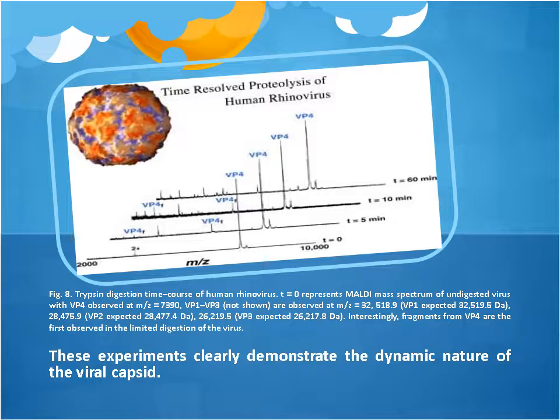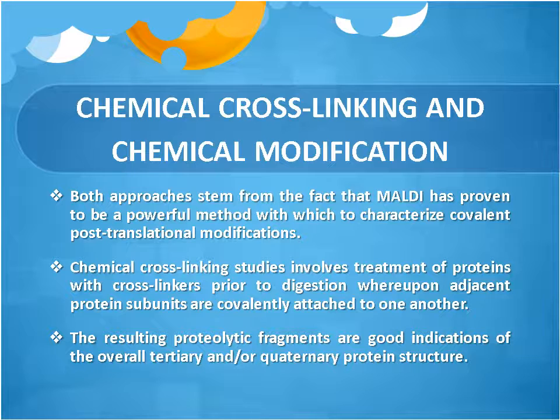This figure shows the results obtained from the trypsin digestion of the time-resolved proteolysis of human rhinovirus. Interestingly, it was found that the fragments from VP4 were first observed in the limited digestion of the virus. These experiments clearly demonstrate the dynamic nature of the viral capsid.